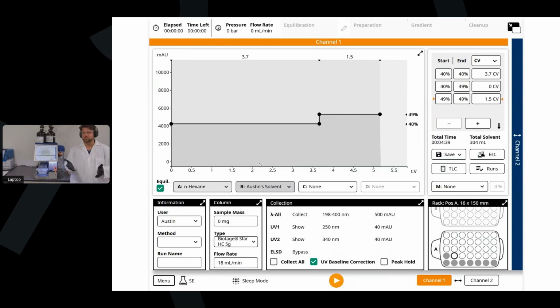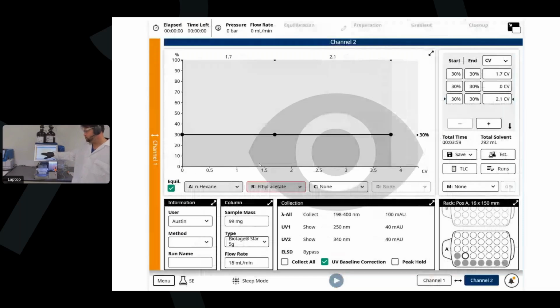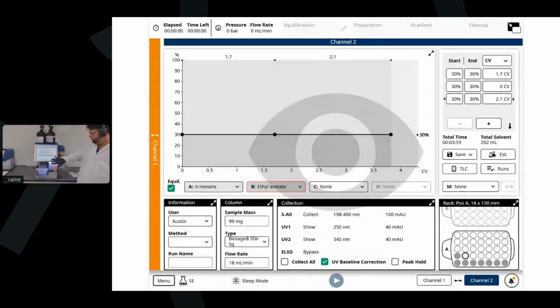Absolutely. Great question. In the Charlotte office, we do peptide work, larger molecule work, and small molecule work here. If the system has been configured with lines that have reverse phase solvents, all you have to do is switch to your second channel, take control back, switch to one channel, and set up your solvent setup appropriately. So I would change my normal phase solvents, like dichloromethane, to maybe methanol and water, or acetonitrile and water. Then I would choose those in the options and hit play.